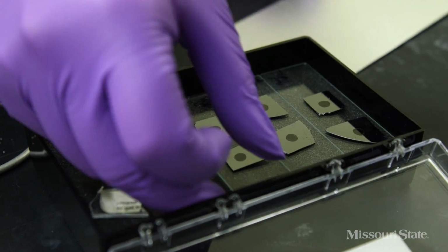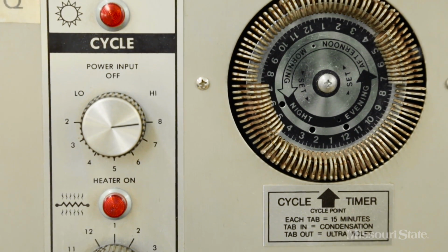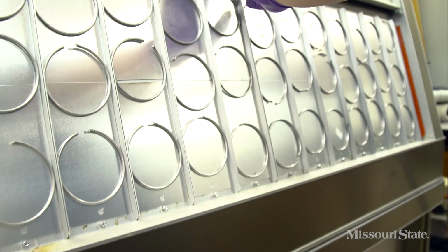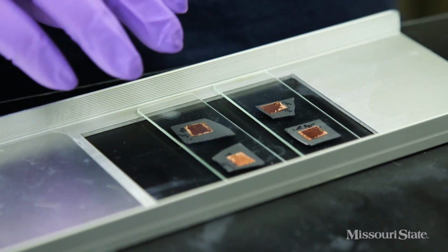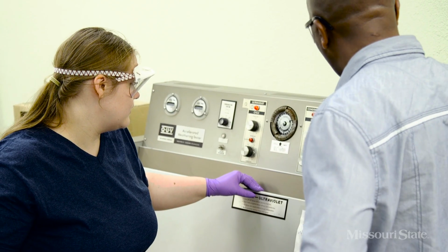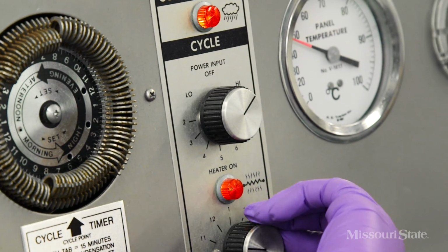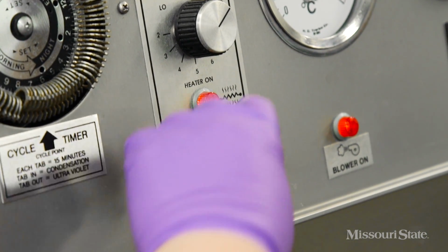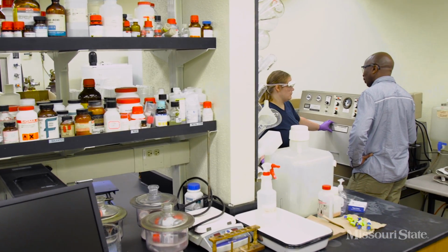So instead of waiting for 50 years, what we are doing is exposing these nanomaterials to accelerated weather conditions that can simulate weathering in maybe 40, 50 years. This is the QUV accelerated weathering tester, and it uses UVA bulbs to simulate the wavelength of sunlight. We've been using the QUV to simulate weather conditions with the condensation cycles, like in the morning when you find dew. So you have your condensation and your UV, and we're trying to see how sunlight affects the properties of the carbon nanotubes at different temperatures.